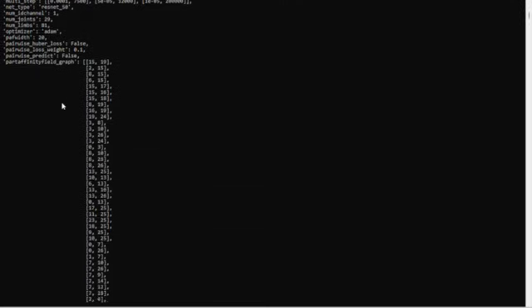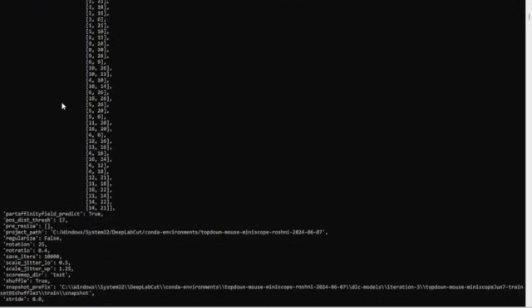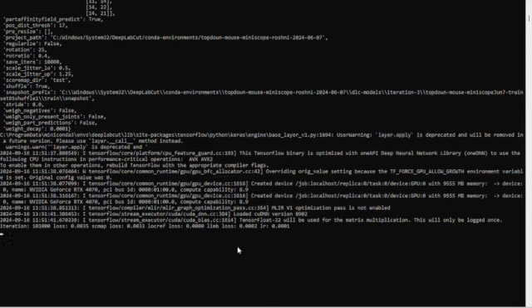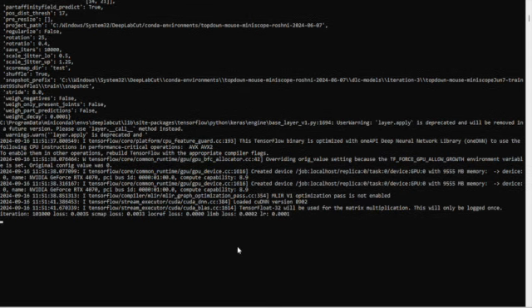And then it will again print out the GPU that it's using. And you can see that it already went through iteration 101,000. And that's all we're really looking for now, is that it's going through all the iterations. And again, we should expect this to finish at 200,000.